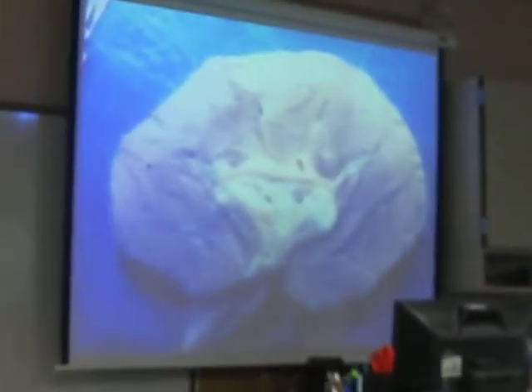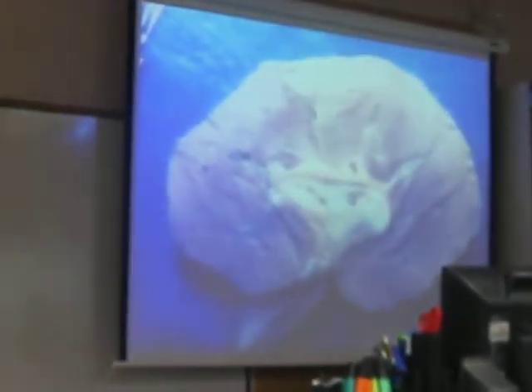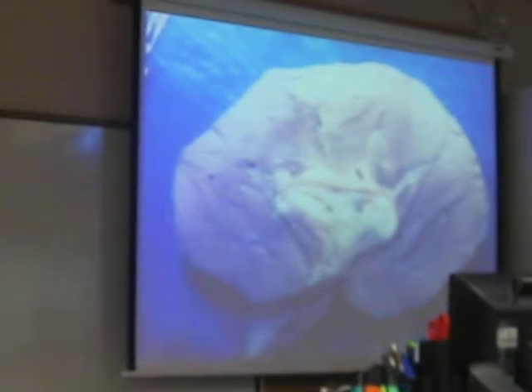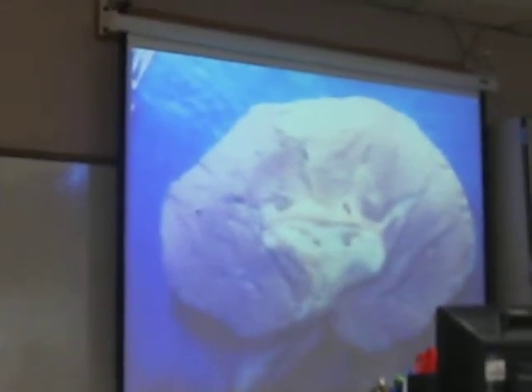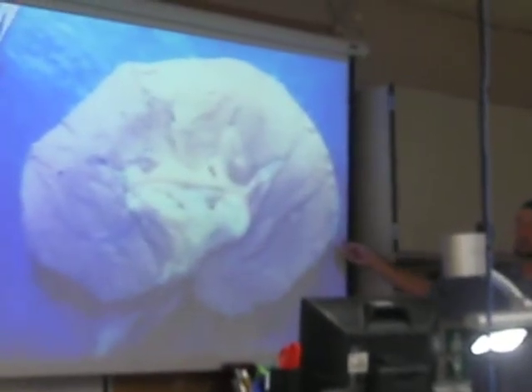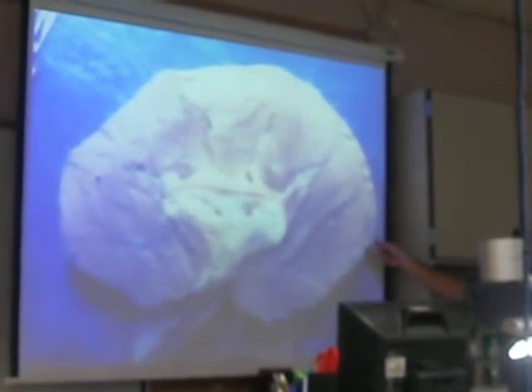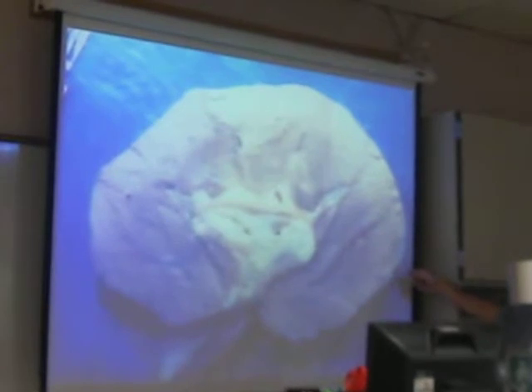So, kidney dissection is going to be pretty straightforward as far as the direct anatomy of it. You're going to grab a kidney and try to do a mid-sagittal section through it as close as possible. And then you're going to spread it out and identify and differentiate some of the regions. Now, one of the first things is, see how here on the outer edge, the little renal capsule. It almost looks like a little bag that the kidney is in. So you should be able to identify that.